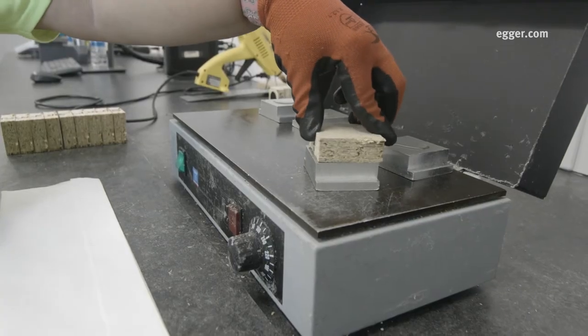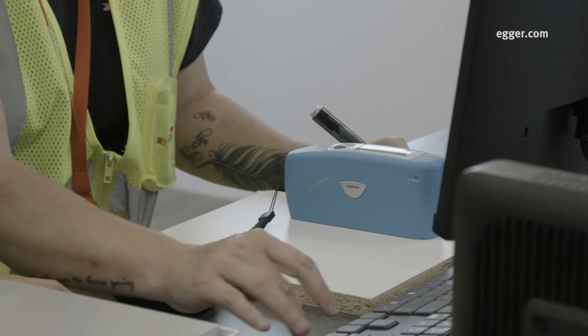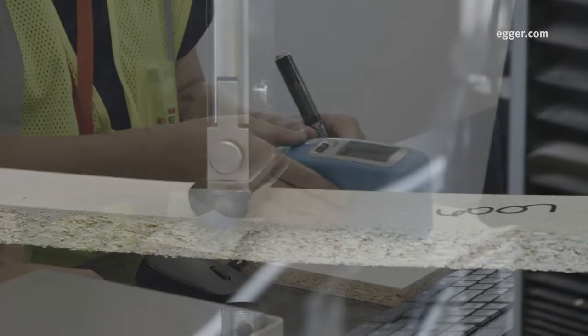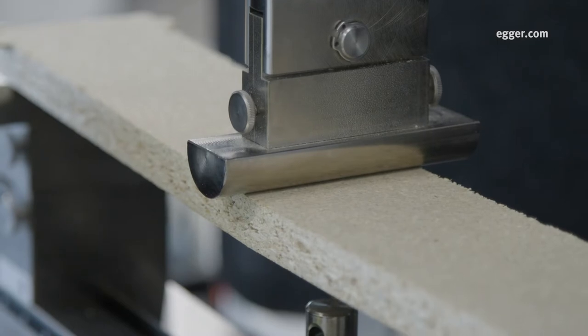The internal bond test checks the bond of the chips within the core layer. Surface soundness tests the strength of the surface, and bending strength determines how much force is required to break the board.